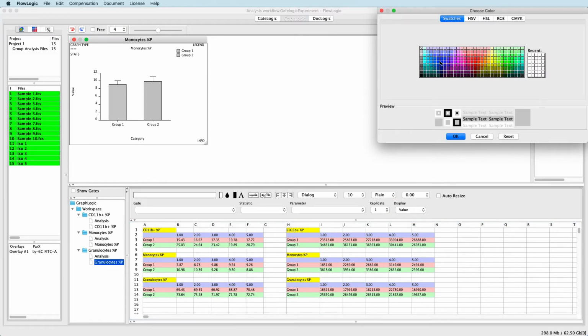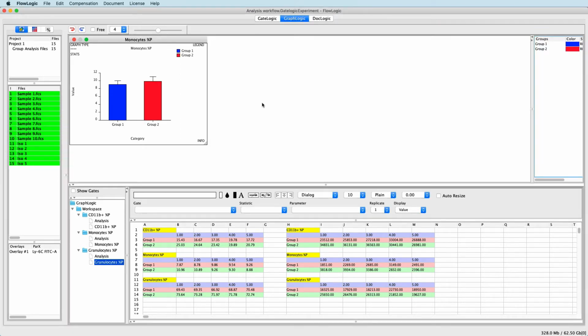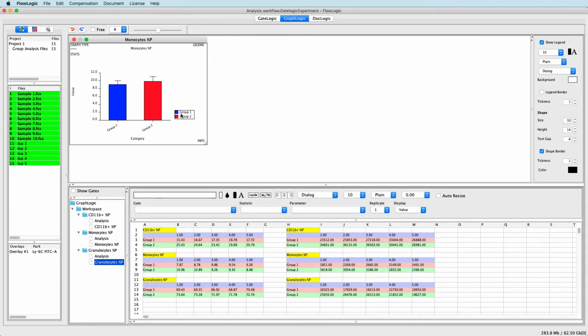You can also click on different components, such as the bars here, which gives you options to change the color. You can also click on the different axes and axis labels. And there are different options within these specific to that part of the graph. For example, we can add 1 decimal place to the y-axis values. And here we can rotate the labels on the x-axis. You can see that you can also click and drag different components, such as the legend or different titles. You can also edit the title and change the font size, type, and style.